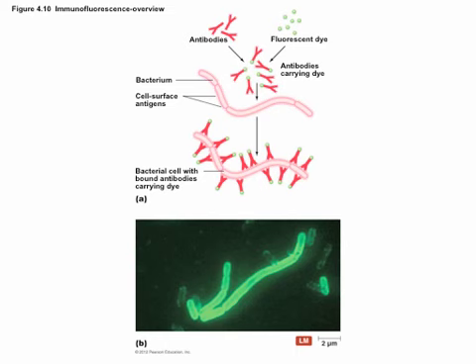Or you could label E. coli green and strep red and look at them next to each other.